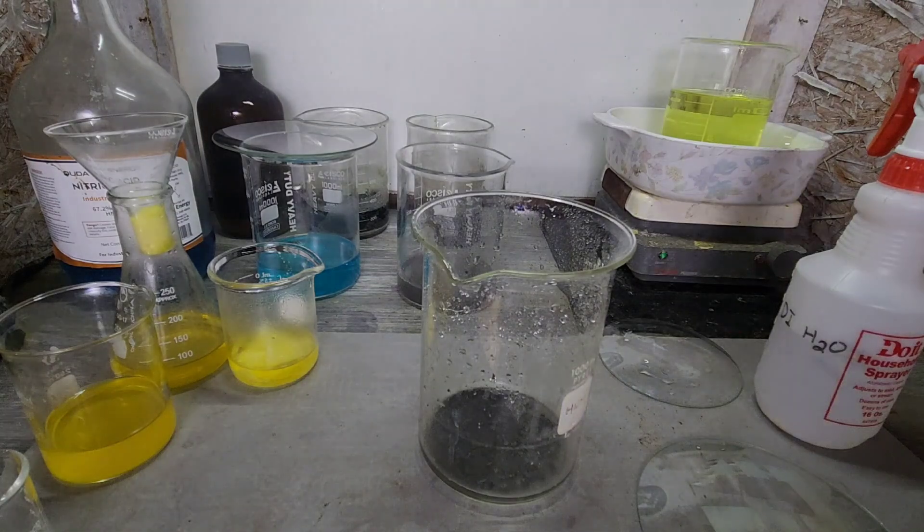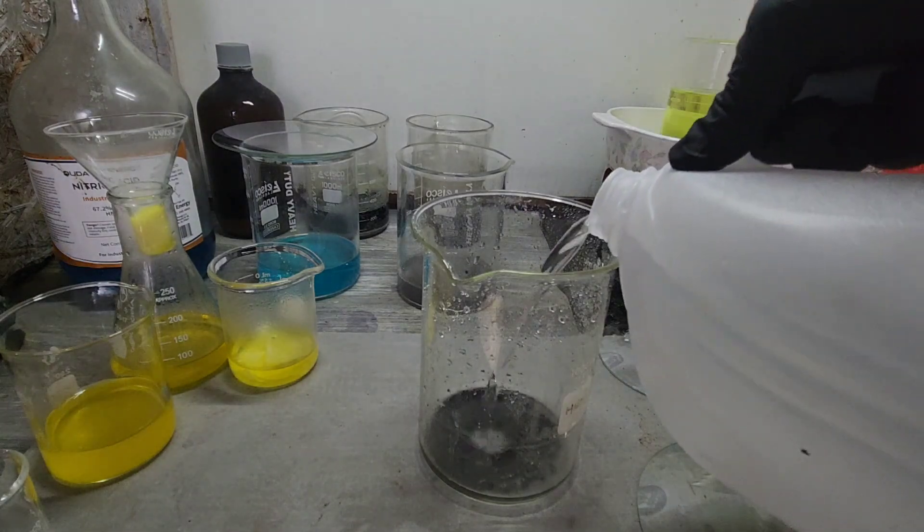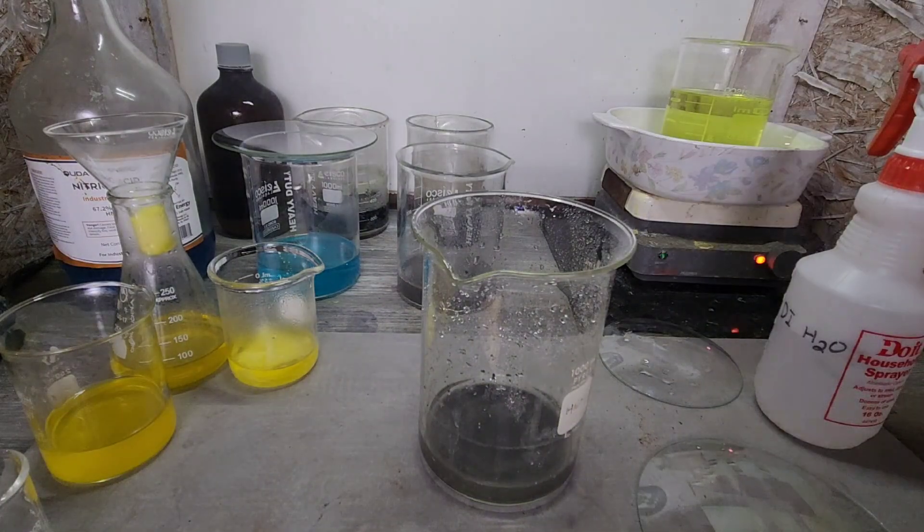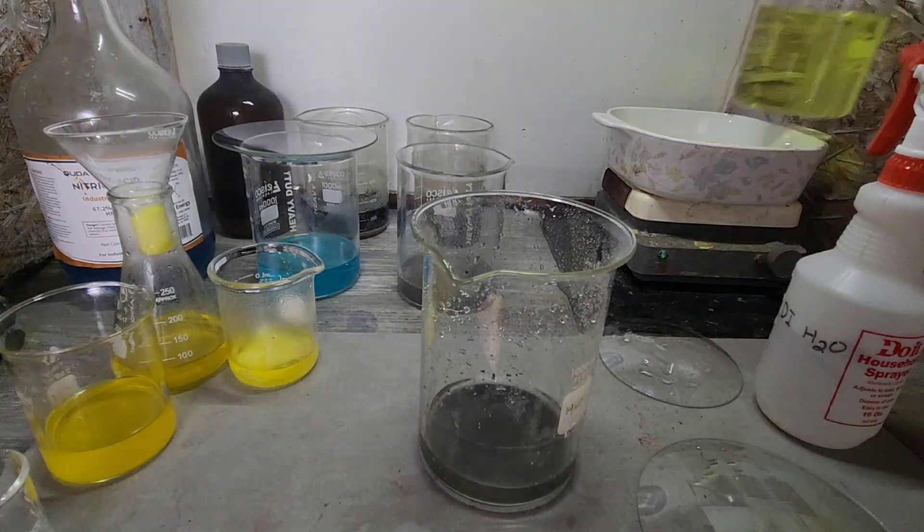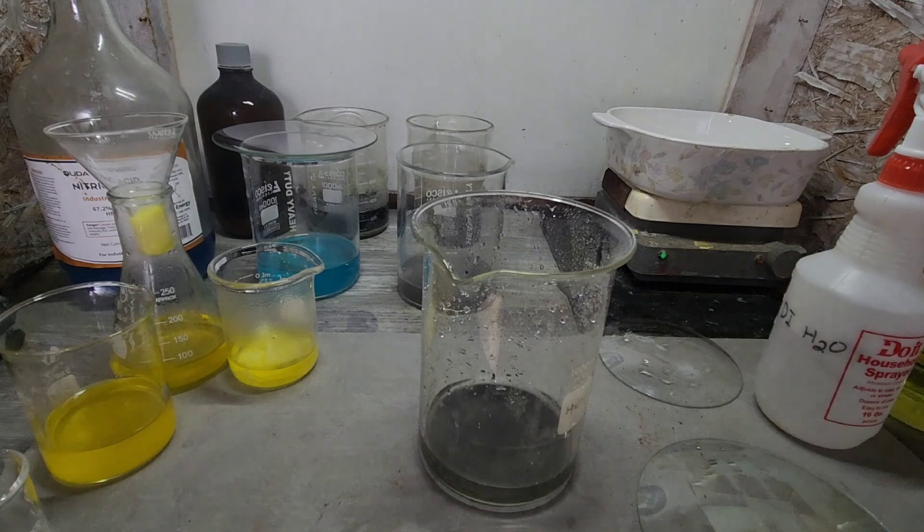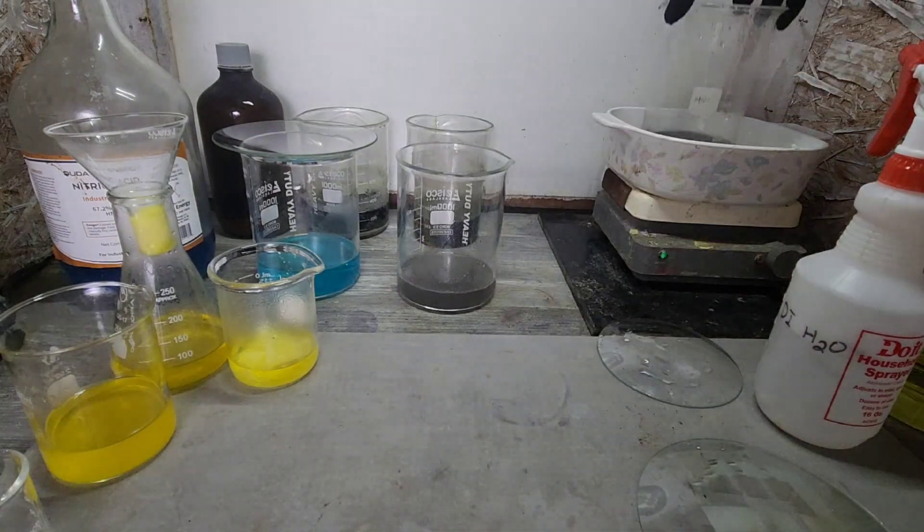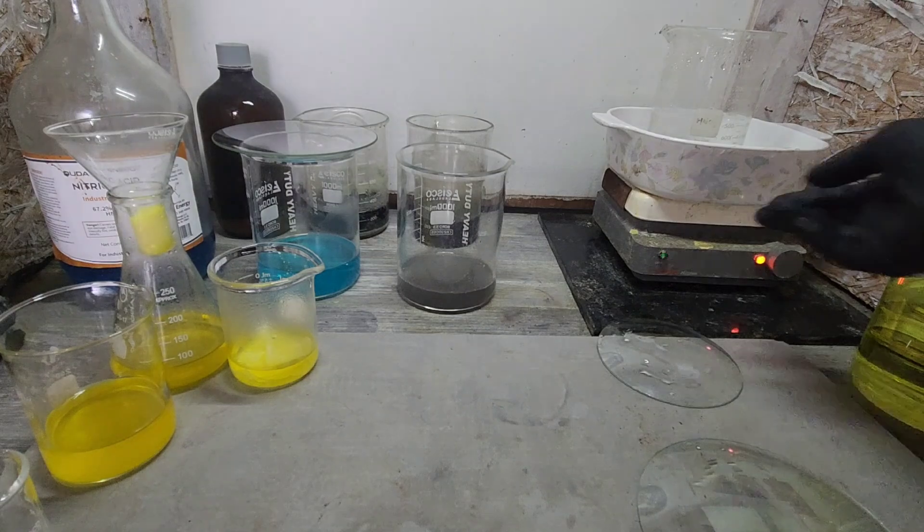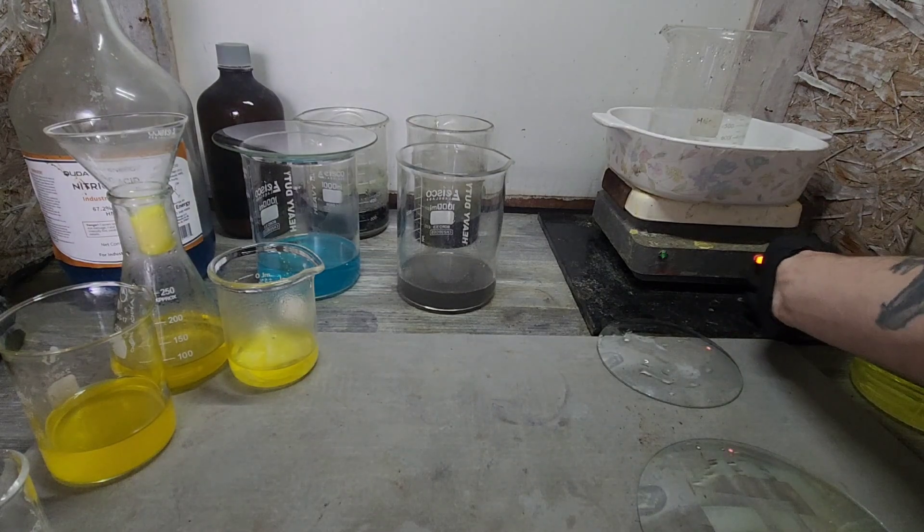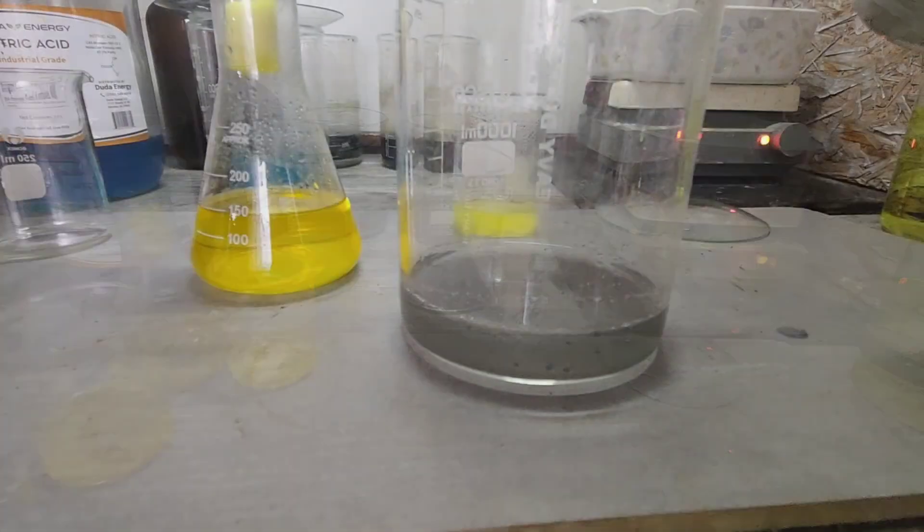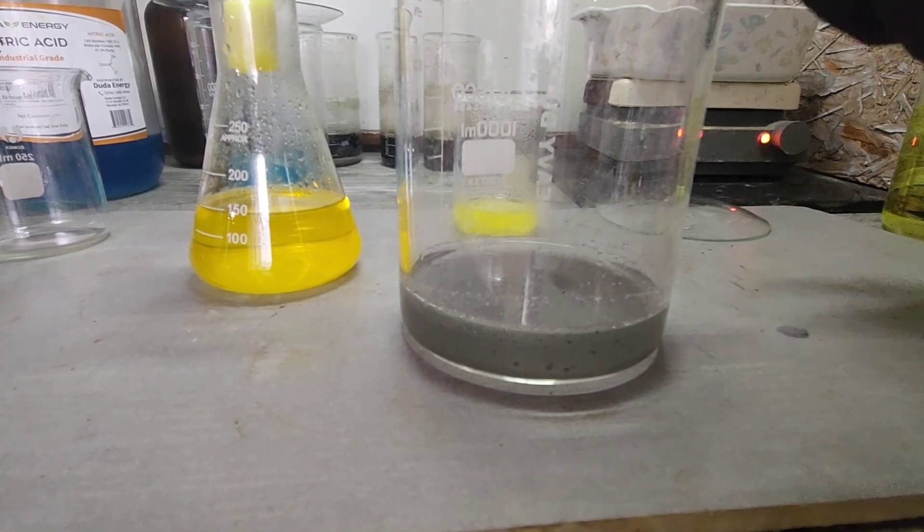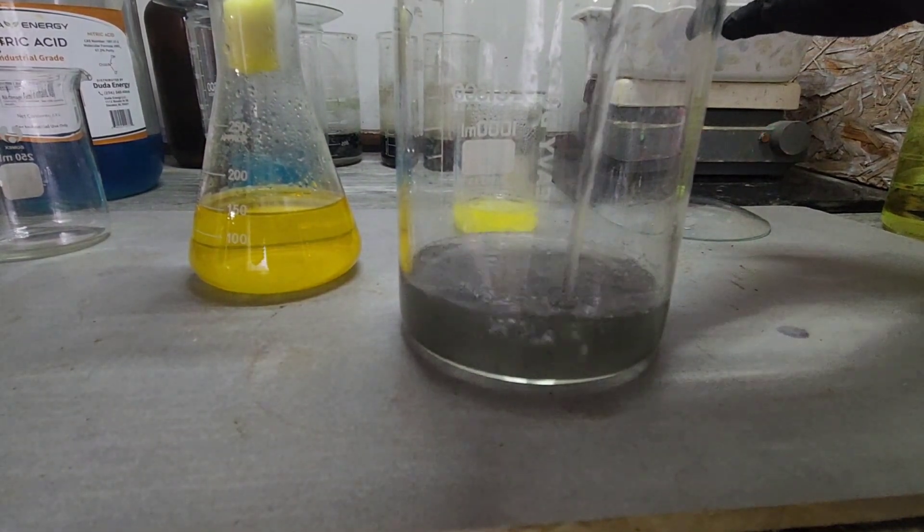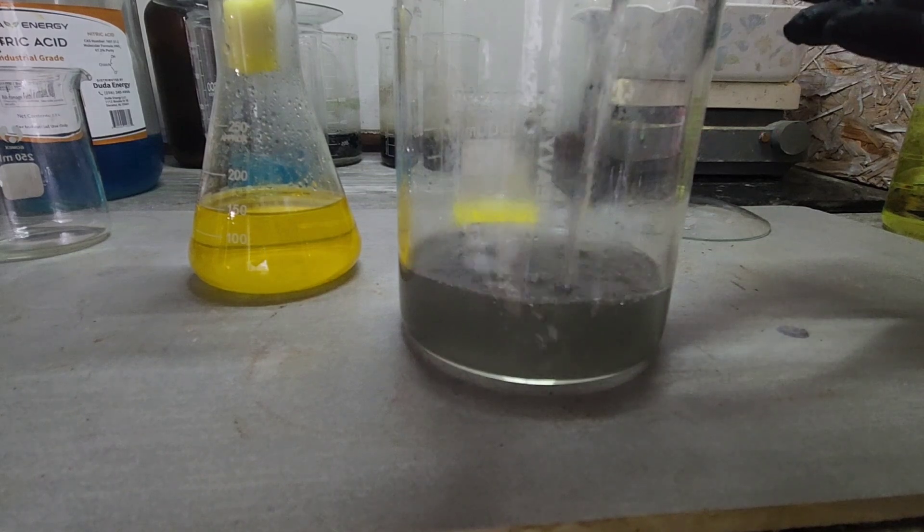Let's grab a little bit of distilled water, just a little bit, and let's boil this. Let's drain the rest of this off and take a look at our metallic silver. There it is.